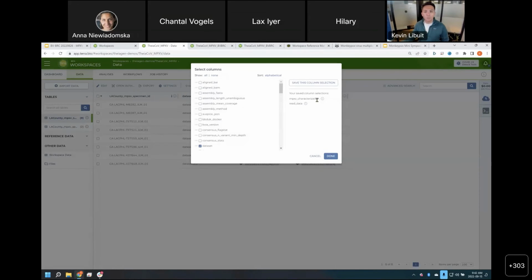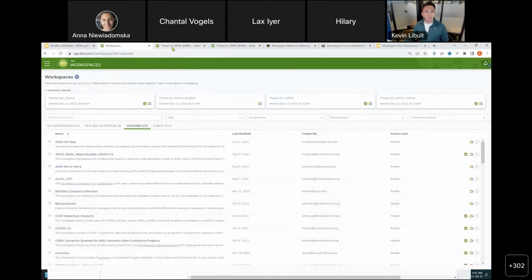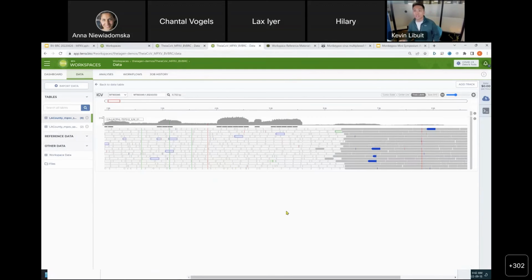But just at a high level, once you have your read data, what this generates is all the characterization components that are specific to monkeypox. And you'll see we have two data sets here, one that has been pre-analyzed, the second of which we recommend users analyze themselves so they get a feel for how to actually use this workflow. And then also on top of that, what's been really nice is that you can even dive deeper into the visualization. So a big conversation is about, what do the ITRs look like with this protocol? Admittedly fuzzy. So there is a lot of incredible information captured throughout, obviously, the non-repetitive regions of this genome. But you can still visualize and see where are the components where we lack the read support or strength in read mapping here.